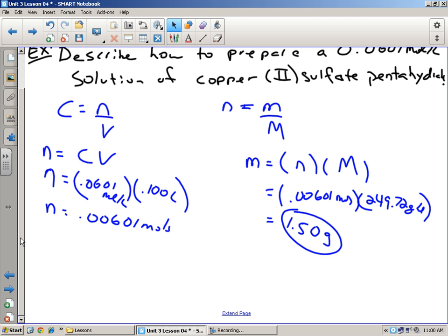There is no lines on this volumetric flask except up in the neck part right here. I don't know if you guys can see that, okay? Basically right where my thumb is, there's a line right above it, okay? And that means when you fill it up with water up to that line right there, that's 1,000 milliliters, all right? That's all it does. There's no other lines on here, so that's all it's good for.